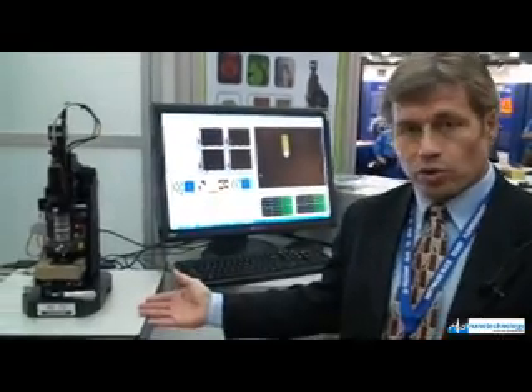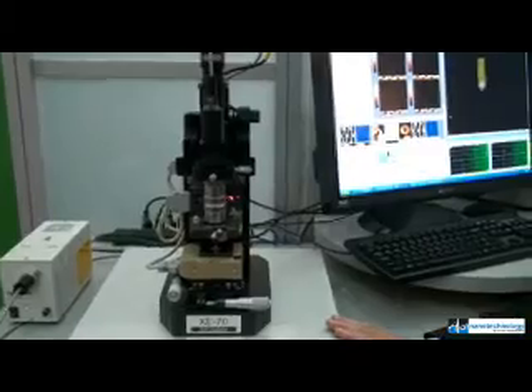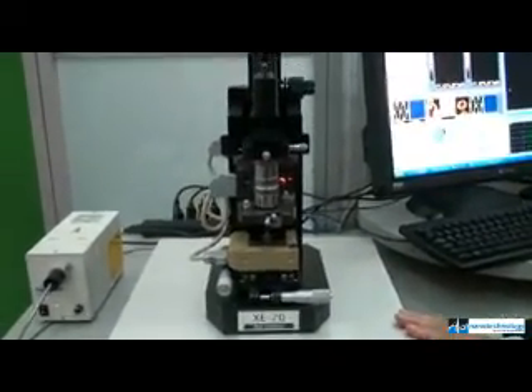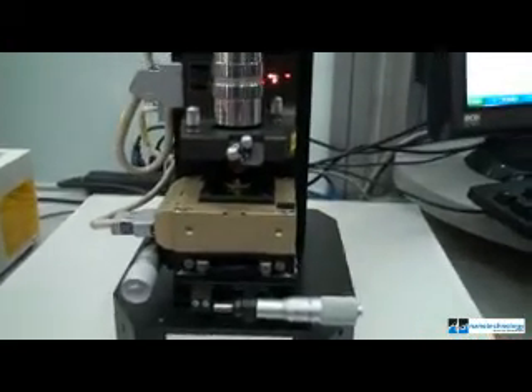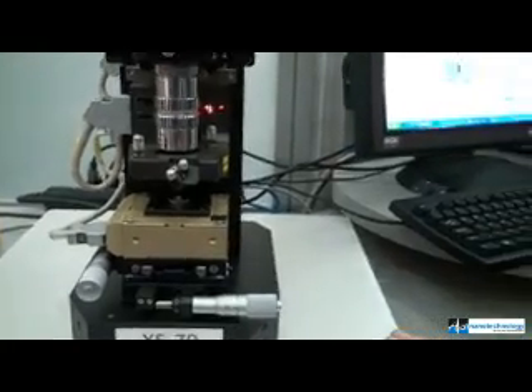The XE70 is an instrument used by academics and people in the research community to measure and inspect their parts at the atomic level. It is an instrument that has the ability to measure things with higher, finer resolution than you can achieve with standard microscopy.